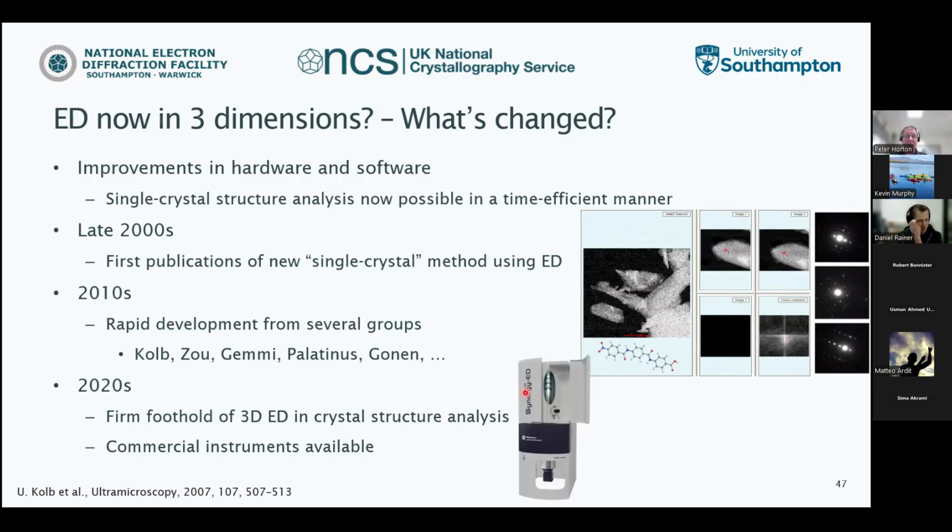These groups developed protocols to do this type of diffraction. Now a collaboration between JEOL, a TEM manufacturer, and Rigaku, a company that sells XRD equipment, produced this instrument.